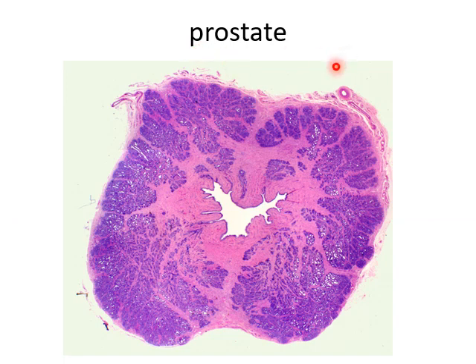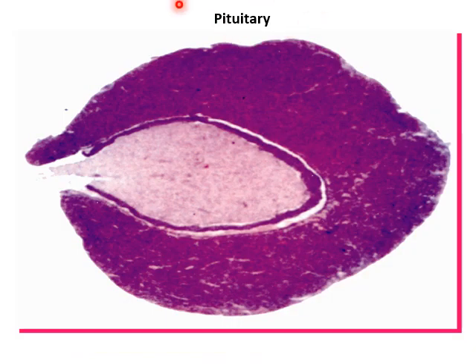Glandular structure: we have the prostate. What are the criteria of the prostate? The prostatic urethra, the connective tissue formed of fibromuscular tissue, and the prostatic acini: small, medium-sized, and large acini, with mucosal, submucosal, and main glands. Pituitary gland. It's a very easy slide. Here is the pars distalis, and here is the pars nervosa. This is the pars intermedia, and this is the cleft. It's a very easy section.